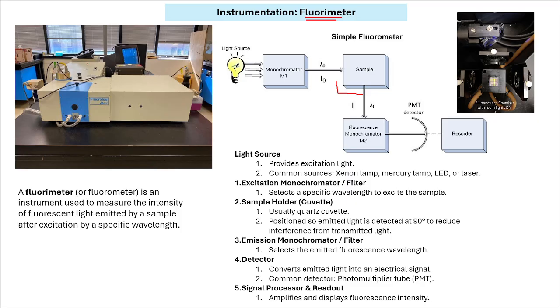Suppose this is the apparatus, this is the lid. When you remove the lid, you will see something like that. So the inside of the instrument looks like this. Okay, so this is the sample chamber.